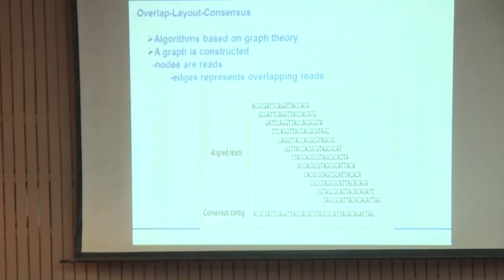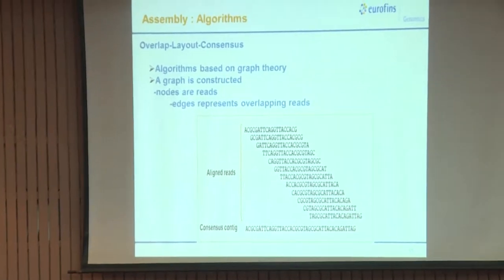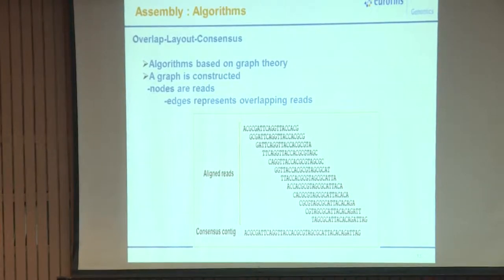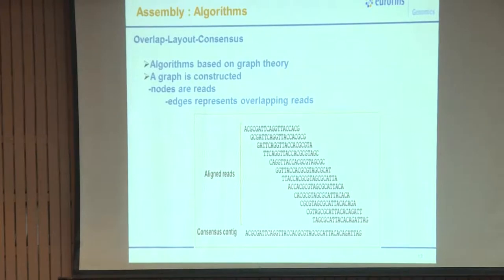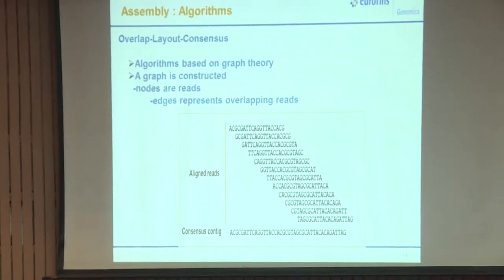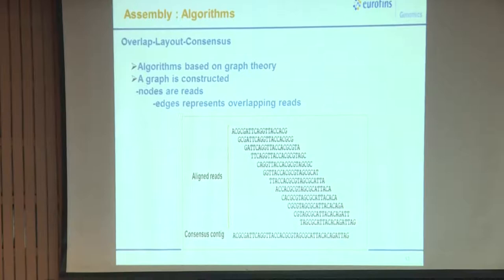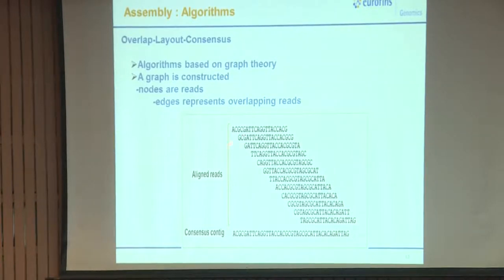So just imagine the mathematical network of nodes and edges. One line here, a circle here, again one circle, one line. This network is created from millions of reads. Just imagine the computational power required for doing millions of sequences. When we talk about 5 GB, it is some millions of sequences, right? So each and every sequence finds an overlap with the first sequence, and that overlap gets built up. Just imagine the capacity required to find these overlaps. And once this overlap is found, we have a consensus sequence. This is how a contig is formed.